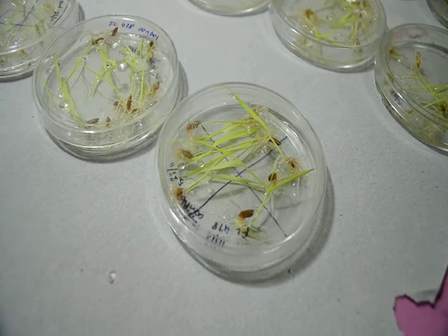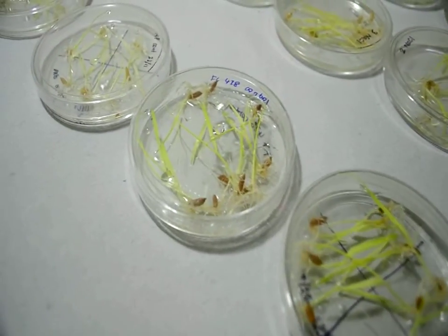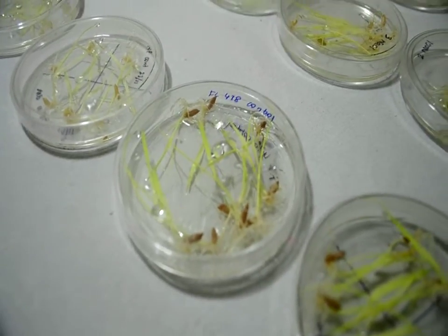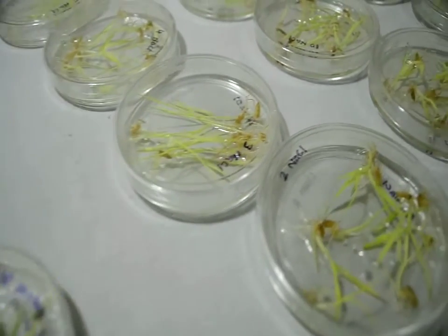The seeds are sown in a petri plate with an appropriate amount of water and NaCl solution to screen various genotypes. This method was selected because of its ease of use and cost effectiveness.